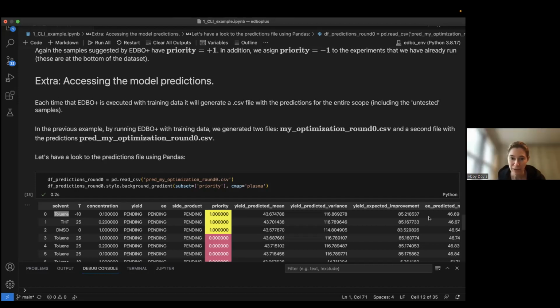Yeah, I think that's right. Although I would add, we've not done controls on this, but the priorities are the experiments that the algorithm suggests you run, and it's going to change priorities based off of the threshold you put. So the data that you put back into the algorithm may not be the best for improving the model performance, because it's looking for this Pareto front, as Rob mentioned, that maximizes your two objectives. And if it's not seeing part of the search space, the predictions might not be quite as good as if you were running it without a threshold.